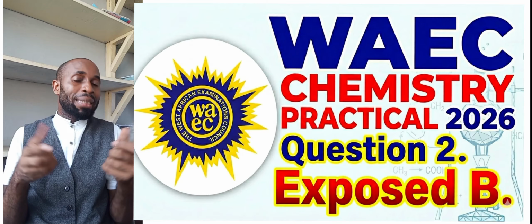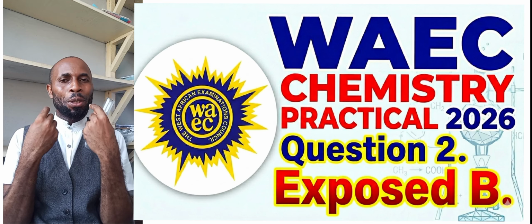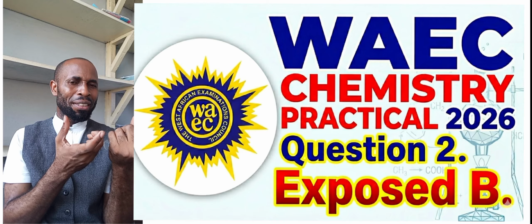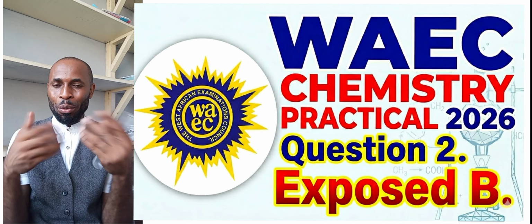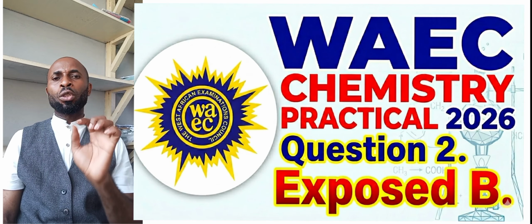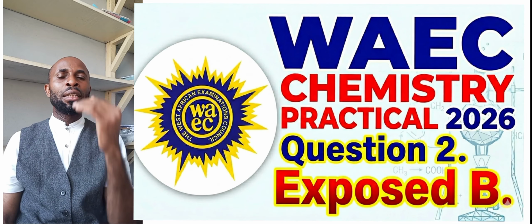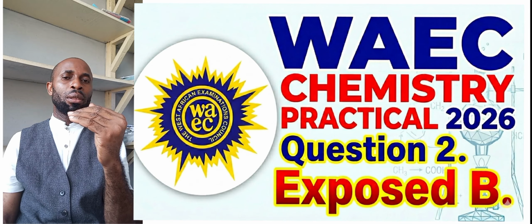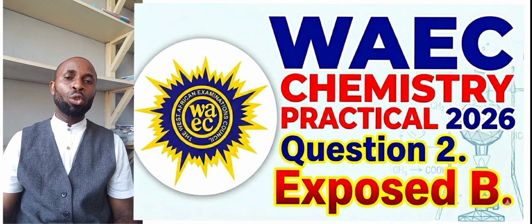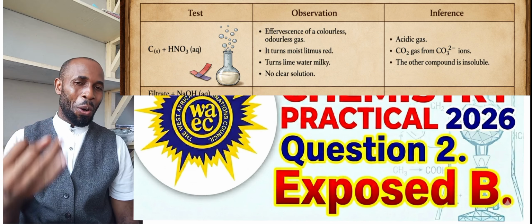So this is the second part I suspect they're supposed to give us, and this is coming from my colleague. My colleague told me, why not also think of adding HNO3 to the sample, since all of them are insoluble. So let's go with the idea. If they ask us to add HNO3 first, we are going to notice that a part of the substance will react, some will remain. While it is reacting, it's going to give us effervescence of a colorless, odorless gas.